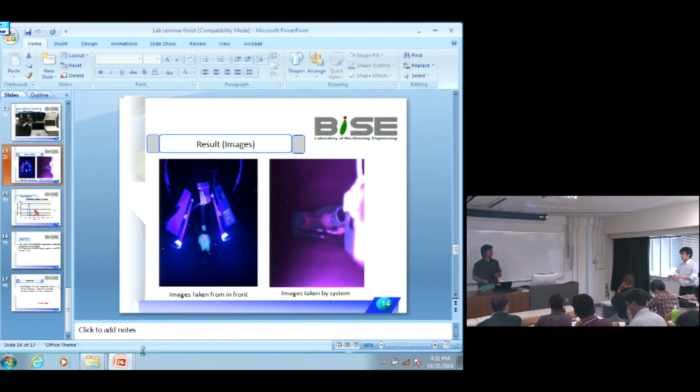Usually such a substance is extracted by filter and a liquid such as ethanol or methanol. Then finally the pure solution is measured. Yeah, I'm thinking about that. Okay, why don't you take the method? Yeah, I'm thinking about that.